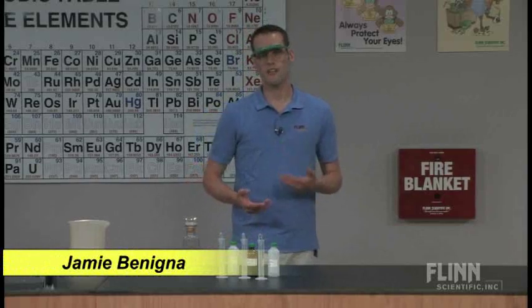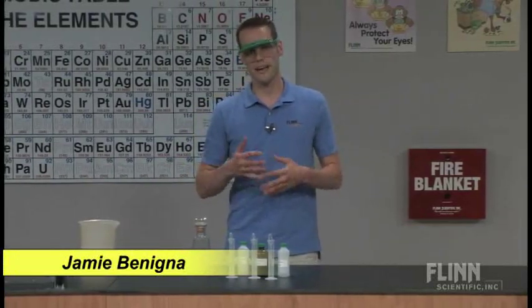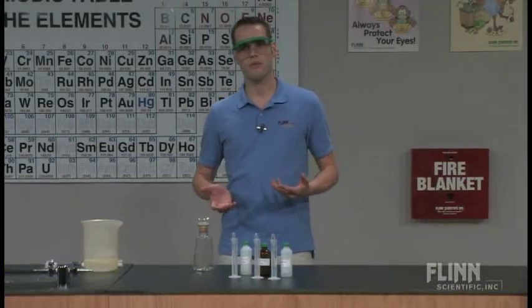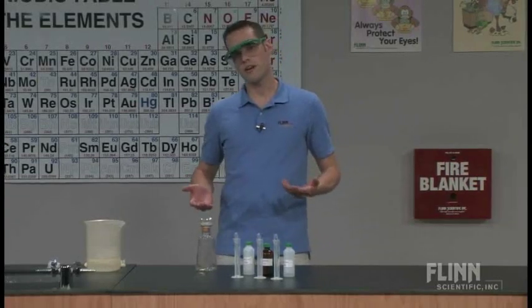Oxidation and reduction reactions are often some of the most interesting and fascinating reactions that my students will ever actually see done. I use the silvering process for the inside of bottles for my students in my advanced chemistry class right before they leave for holiday break in December.